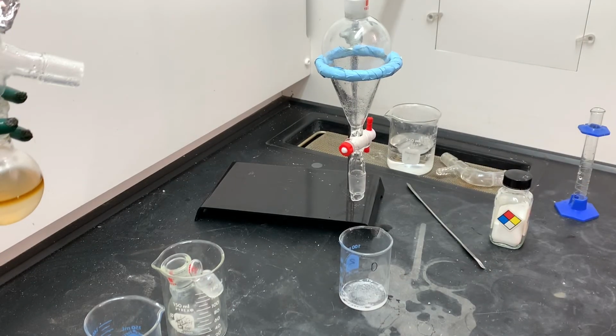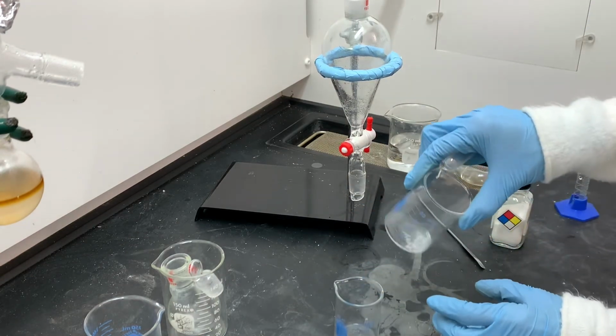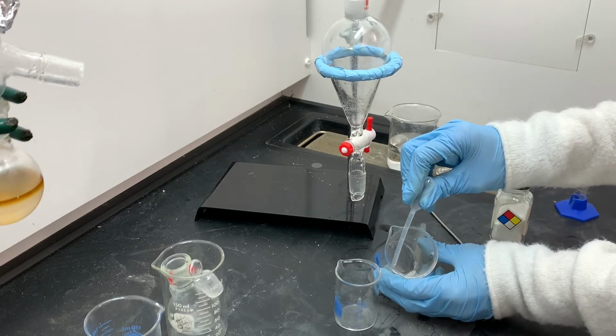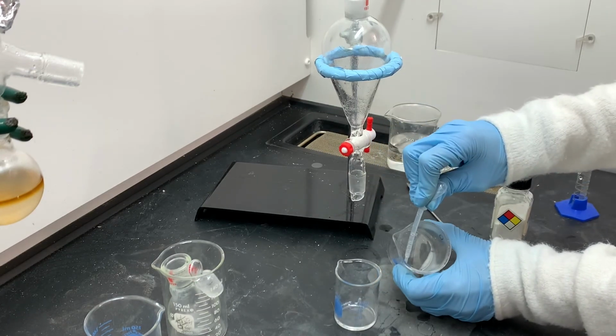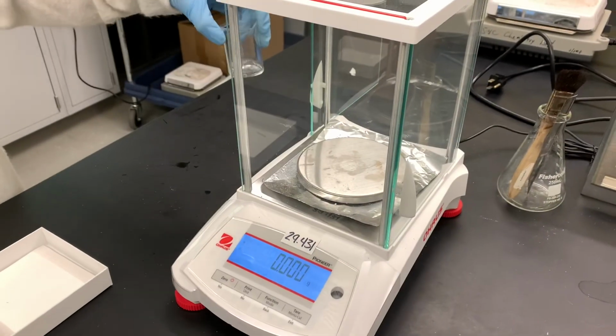And my last goal is just to remove the liquid from that drying agent and put it into a fresh beaker. I didn't mention this, but the product is a liquid. And so this liquid that we see here is just our pure product. There's no solvent or anything like that. All right, we are ready to get a mass of this product.